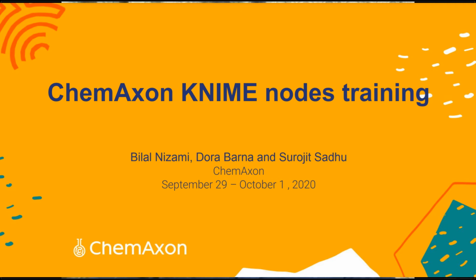So today we will be focusing on the first workflow that Dora would be presenting, which will be building a drug discovery workflow in 8 steps. Bilal has already given an introduction about that workflow yesterday. We will be focusing today on the workflow and how to build parts of it, because I don't think that we will be able to build such a complicated workflow in 1.5 hours, but we will be trying to explain the entire workflow and show you how you can build the parts of that workflow so that you can replicate the same with other parts also.